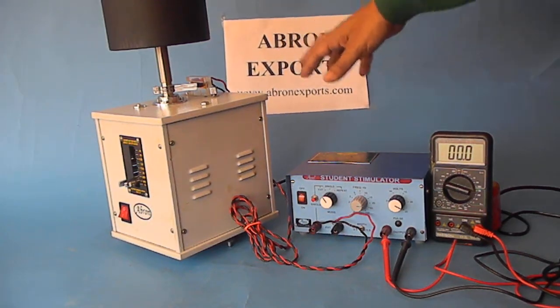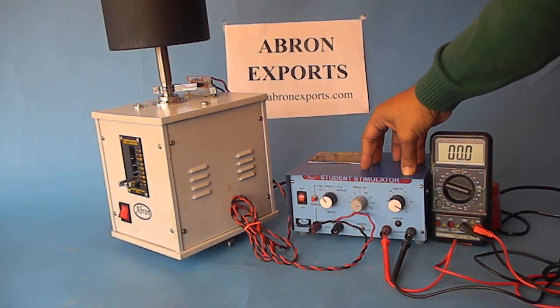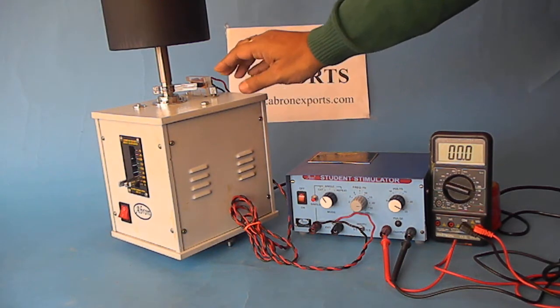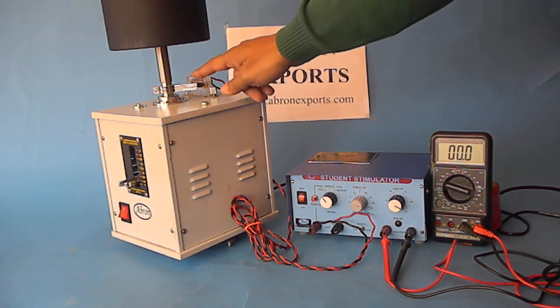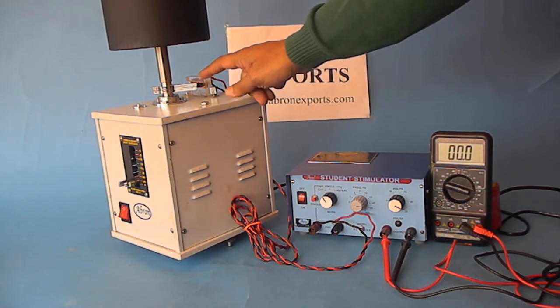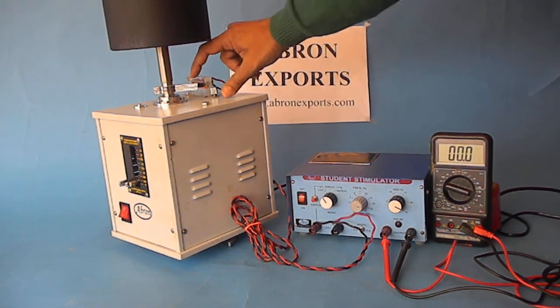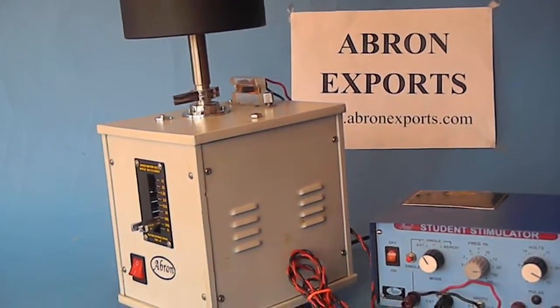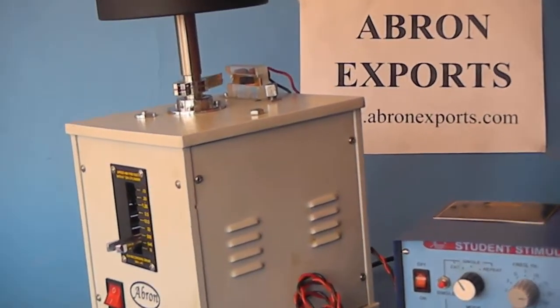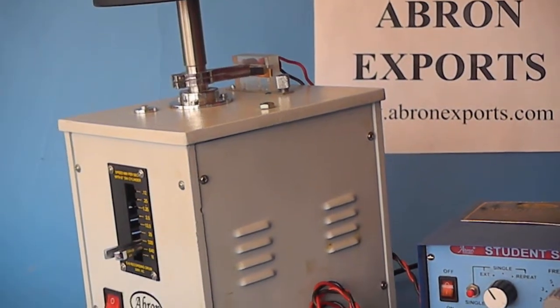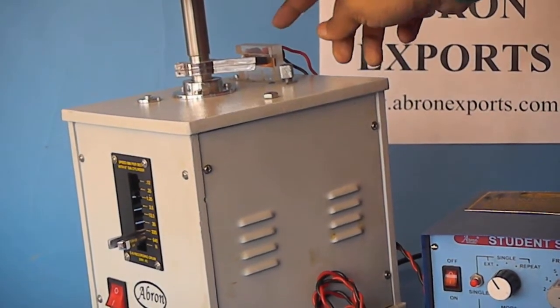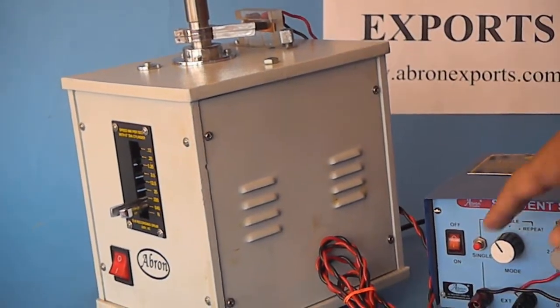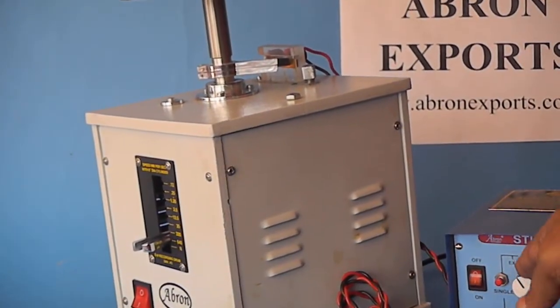This is the stimulator by Abron Export and this is the chymograph for getting a stimulator pulse. This is the pointer which touches this point, and when it moves like this on rotation by speed selection, it touches here and gives a pulse from the chymograph to the stimulator.